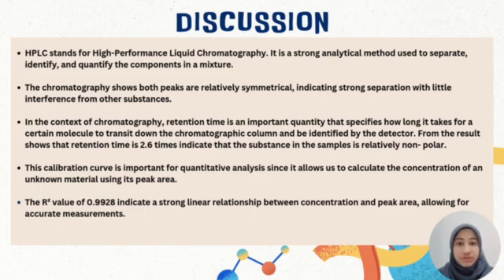HPLC stands for High Performance Liquid Chromatography. It is a strong analytical method used to separate, identify, and quantify the components in a mixture. The chromatogram shows both peaks are relatively symmetrical, indicating strong separation with little interference from other substances.